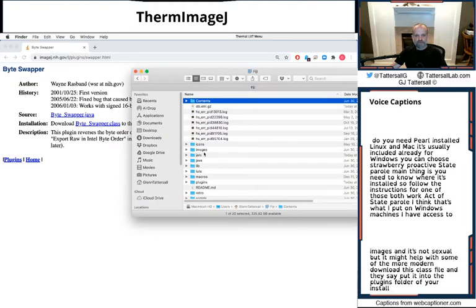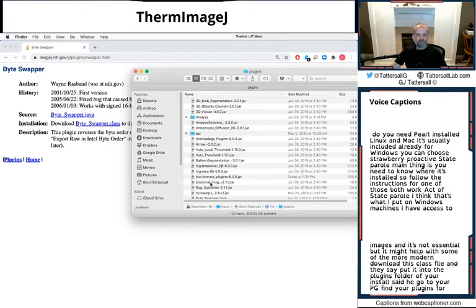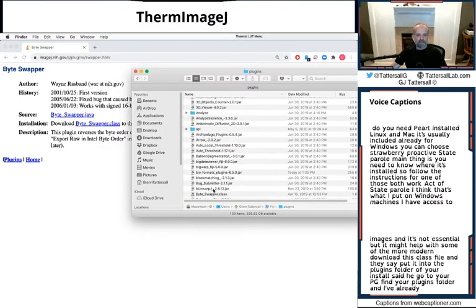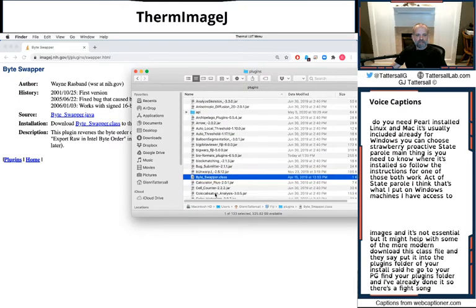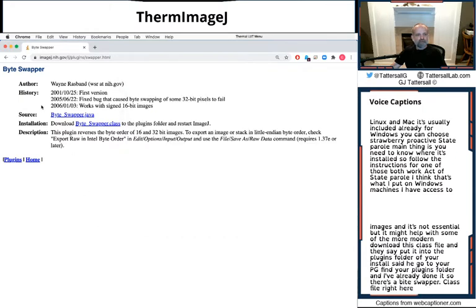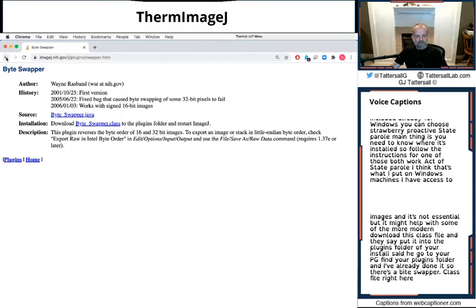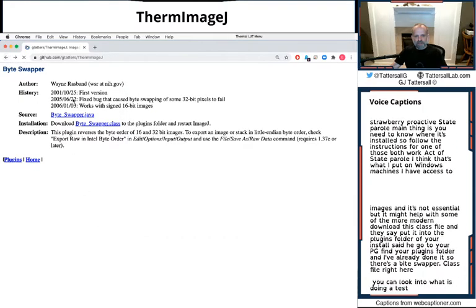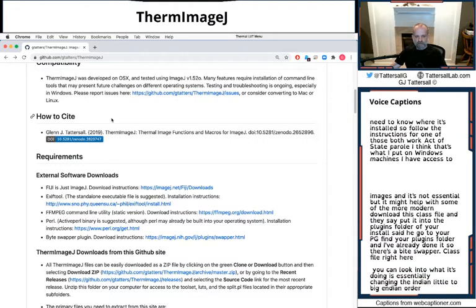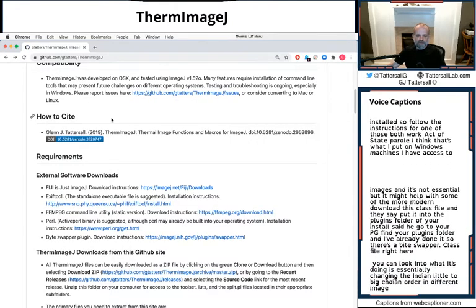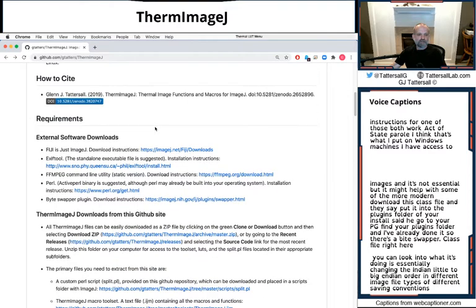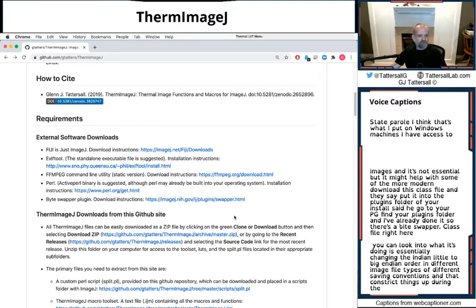So you go to your Fiji, find your plugins folder, and I've already done it. So there's a Byteswapper.class file right here. You can look into what it's doing. It's essentially changing the endian, little to big endian order. Different image file types have different saving conventions and that can trip things up during the conversion process.